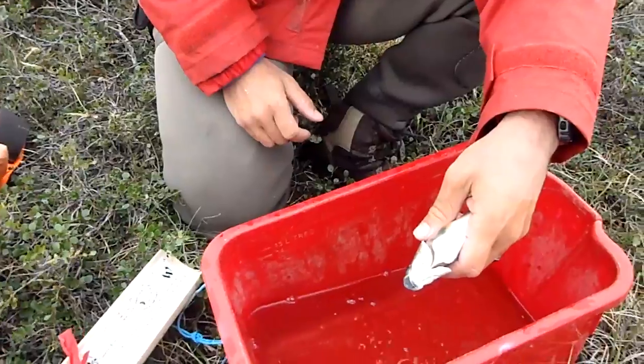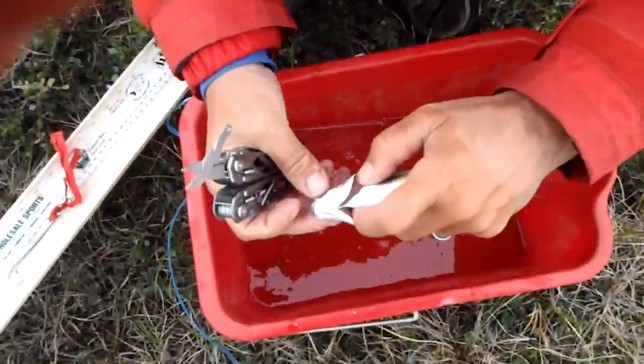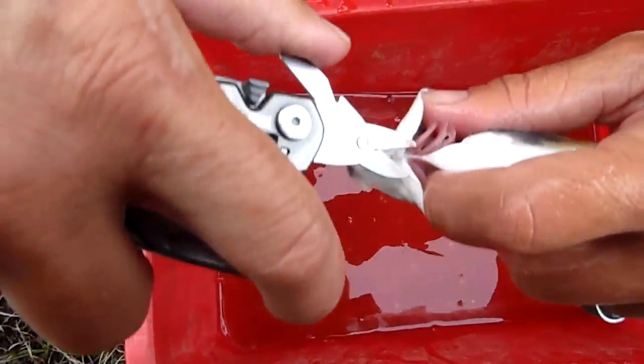And Derek is our surgeon. Are you ready to start? You're ready. Scissors. Excellent. Okay, so we're going to peel back the gills first of all, and we're going to snip right in this area right here.